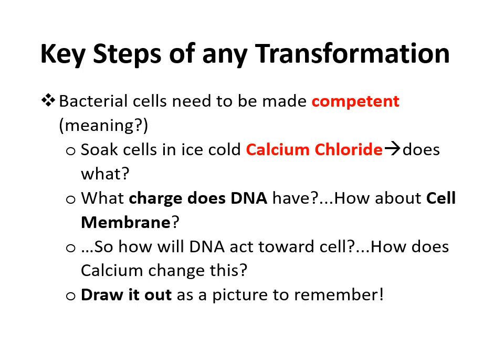Because what happens is when you add the calcium chloride and it dissociates into calcium ions, you now have highly positive calcium that coats the negative bacterial cell, so that in the next step when you add the plasmid DNA, the DNA now thinks that bacterial cell is highly positive because it's wearing, think of it as wearing a coat of positive charged calcium ions.